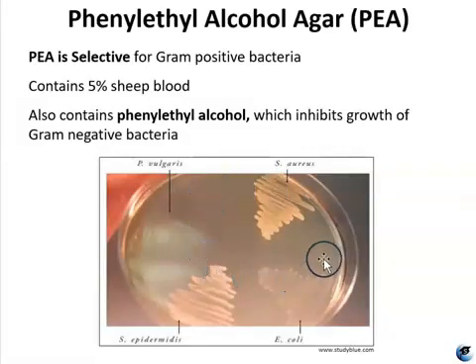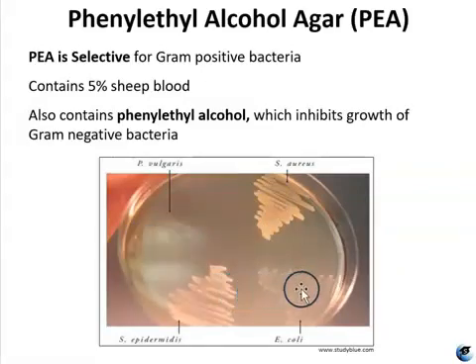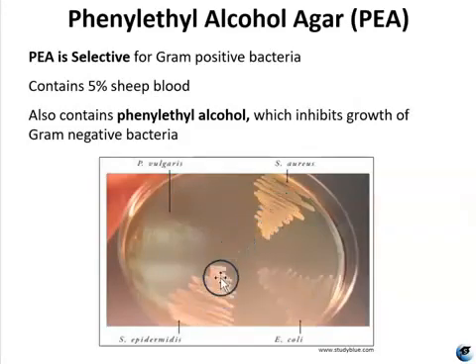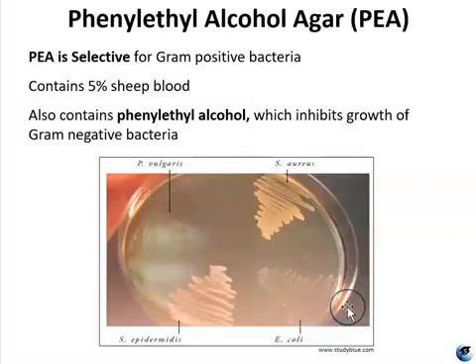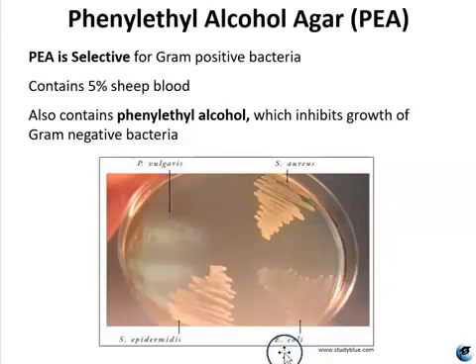Here is an example of a PEA plate that has four species growing on it. When you interpret this growth, you first want to look to see if there is good growth. It looks like Staph aureus and Staph epidermidis have pretty good growth. E. coli is a bit more questionable — it's kind of semi-transparent, and if you're not sure if that is considered good growth, you would want to look at E. coli on nutrient agar for comparison. It's completely okay to Google image search to see what it should look like. We know that E. coli is a gram-negative species, so this growth would be suspect.